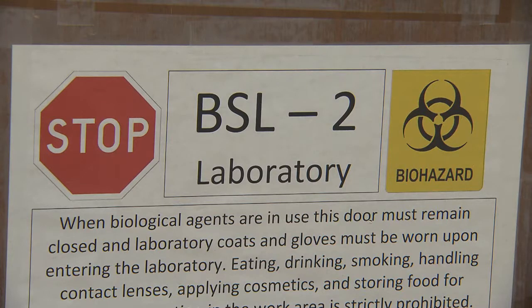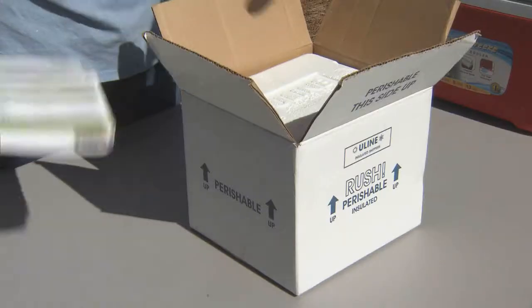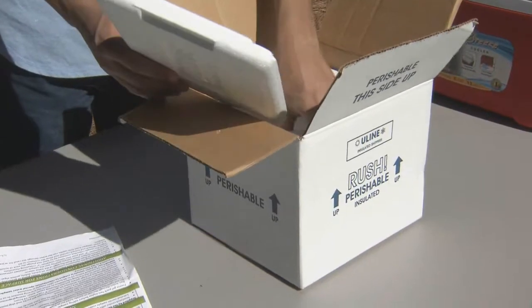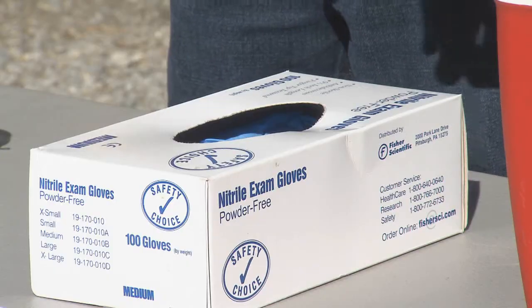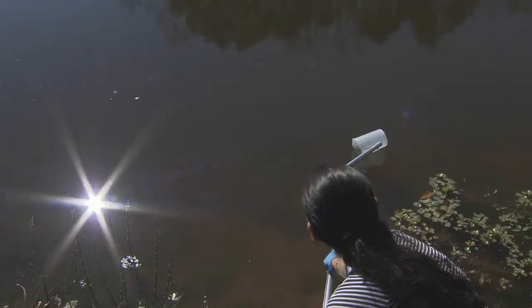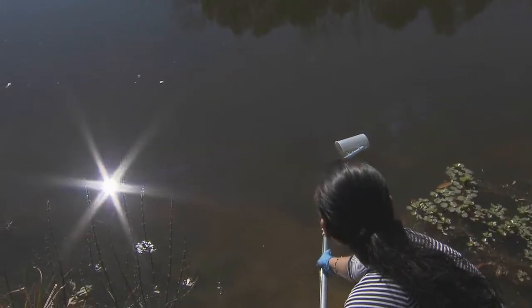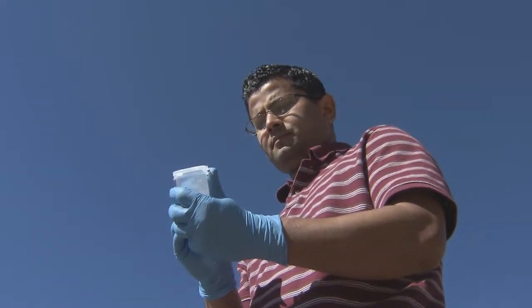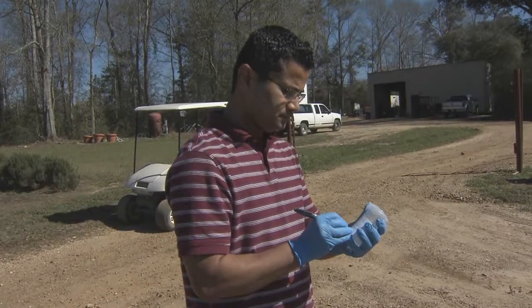Contact your laboratory several days prior to sampling. The laboratory you are sending samples to for testing usually provides pre-sterilized containers and other sampling supplies, instructions, and record-keeping forms. Proper collection and reliable record-keeping are essential. Tracking and properly identifying sample locations are as important as water collection.